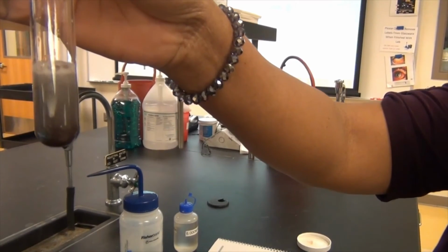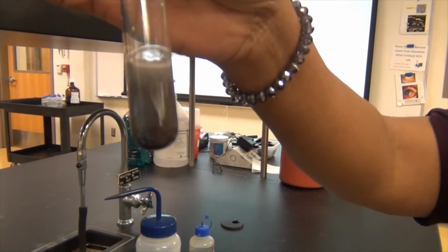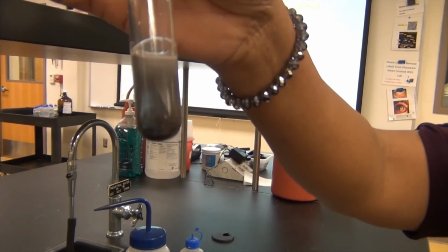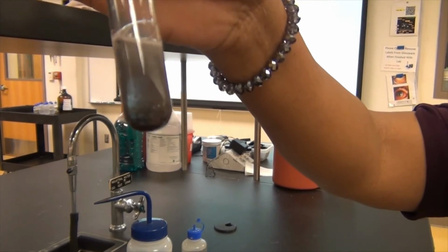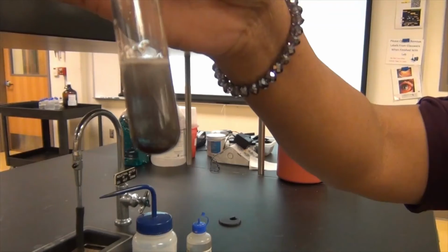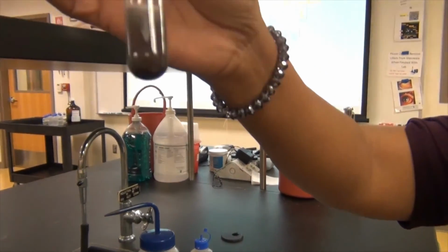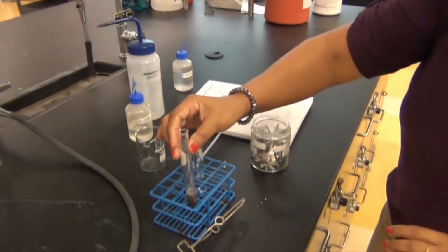And look at the color. Look at any solid formation that's going on. This is the last step, as I said. So here's what I'm going to do. While you observe this reaction, I'm going to go ahead and get a spatula and remove the magnesium, because then you can see a little bit better. So I will be right back.